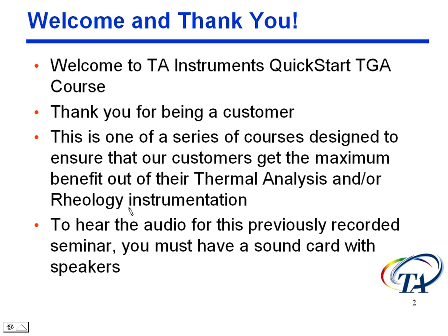Also, since it's previously recorded, there's not a live instructor that you can ask questions of. But what we can do is at the end of this presentation, there'll be an email address, and you can email questions to that. Now, at the bottom right-hand corner of the screen, on every slide, you will see a slide number, and I've just circled one there so you can see it. And this is the number that you can refer to when you get email. So you could say, I have a question on slide number 56 of X amount, okay?